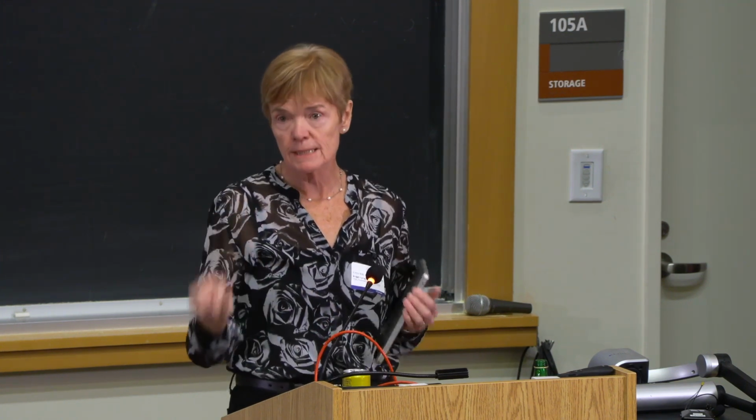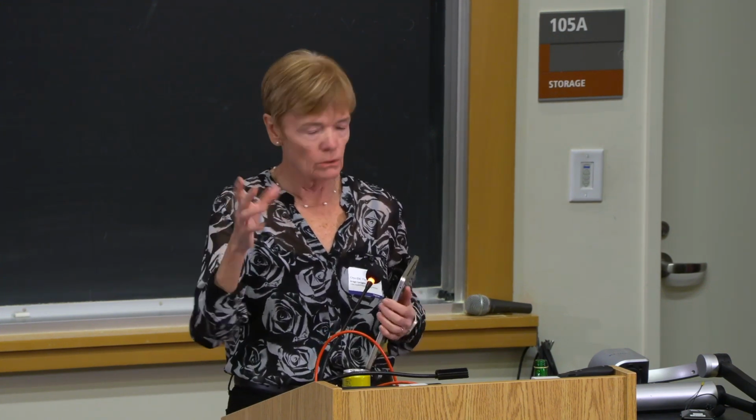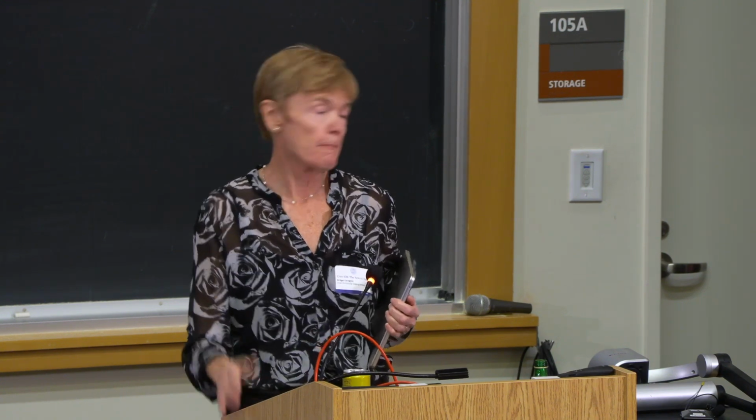We haven't seen what the models look like yet because it's still sequestered, but the scores look extremely encouraging. It's only lysate, though. We really want to do this on in situ cellular material, and that will be one of the points of this workshop, to discuss how we do that. Because establishing ground truth on this lysate was a nightmare. I don't even know how to establish it in real cellular material. But maybe we don't need to. Maybe we can have some compromise, and that's what we would want to discuss with the community.